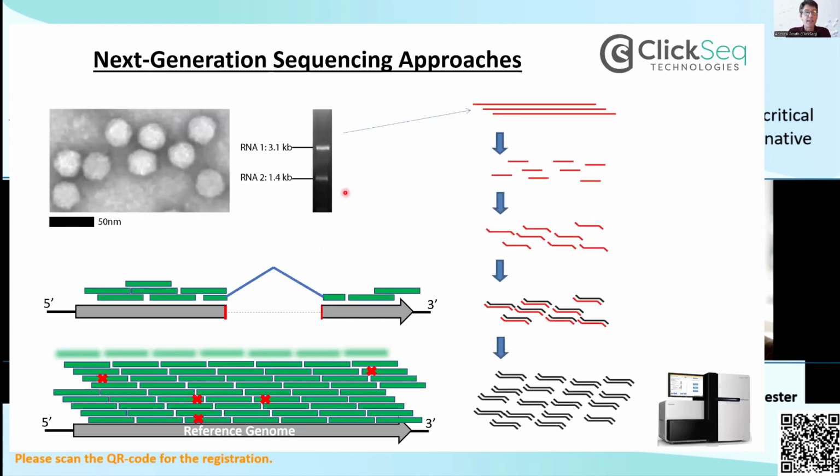Next generation sequencing is a really excellent tool for studying diversity of RNA viruses or DNA viruses. As a general approach, you can take a purified virus, take the extracted RNA, and subject it to next generation sequencing. Very briefly, you would take that RNA, fragment it into lots of short chunks, ligate on or use PCR to add sequencing adapters, and then sequence those on an Illumina platform.